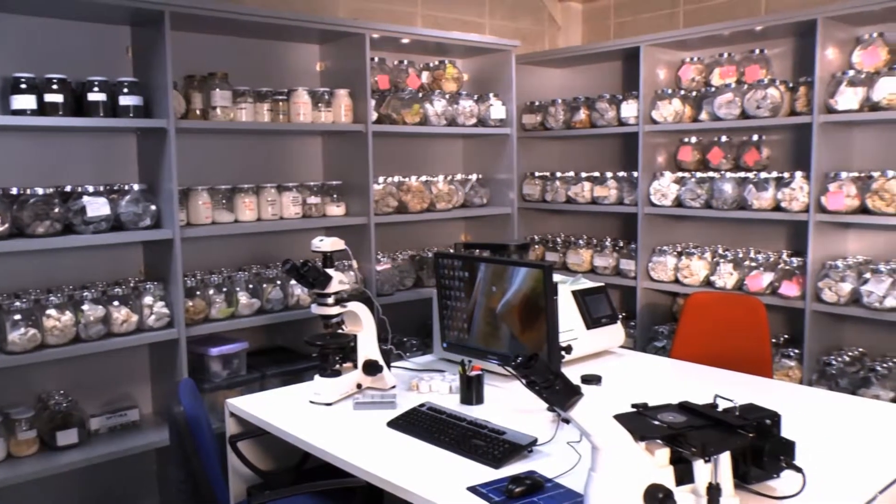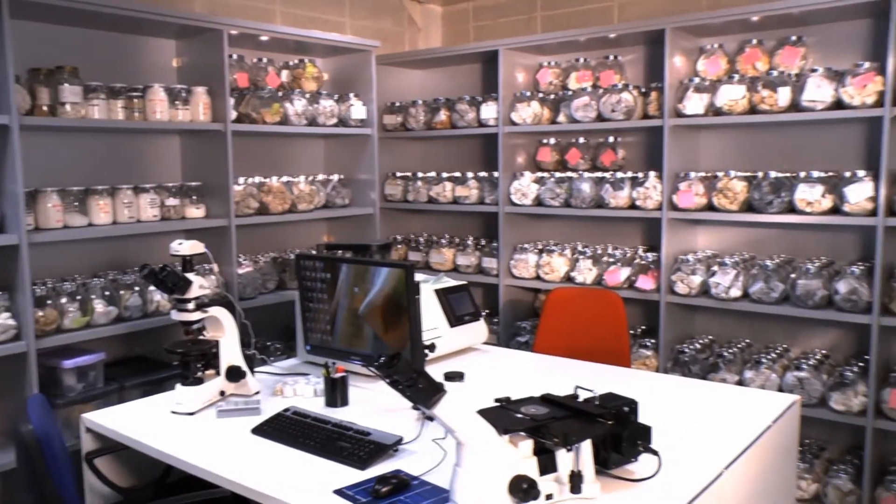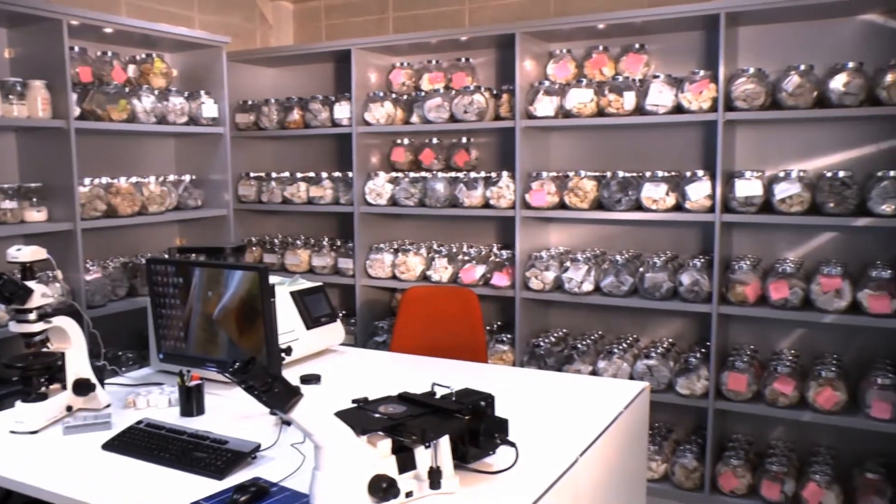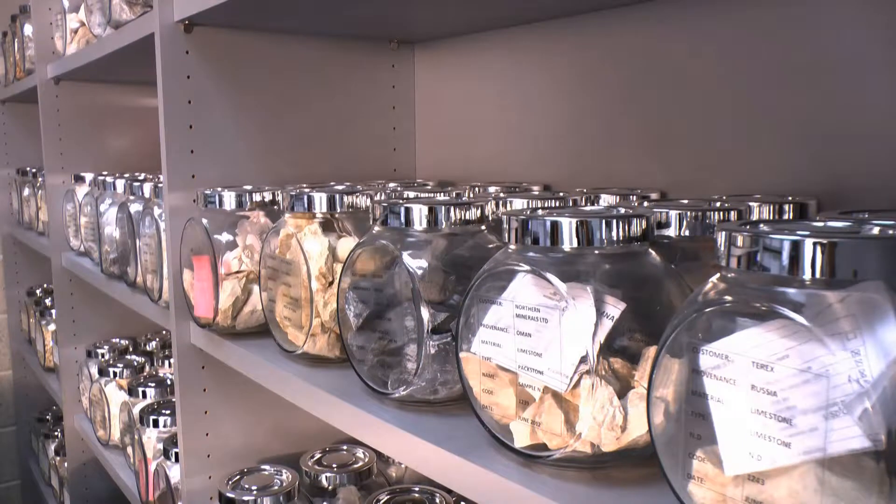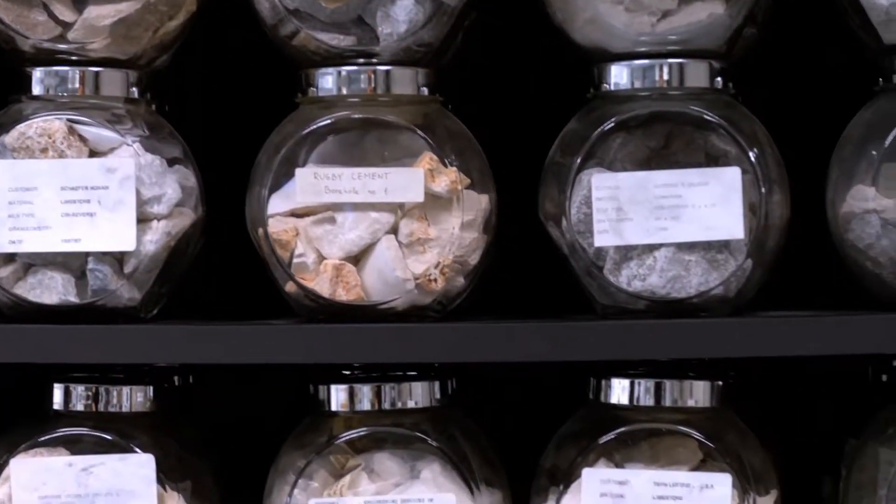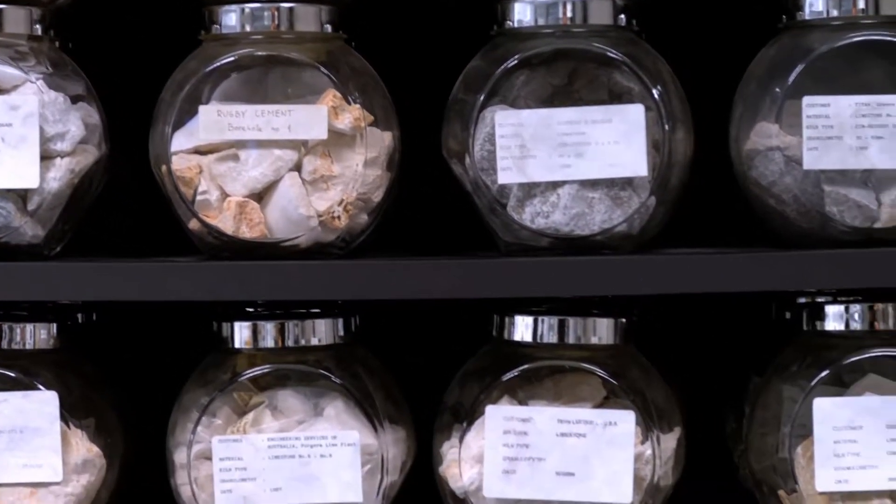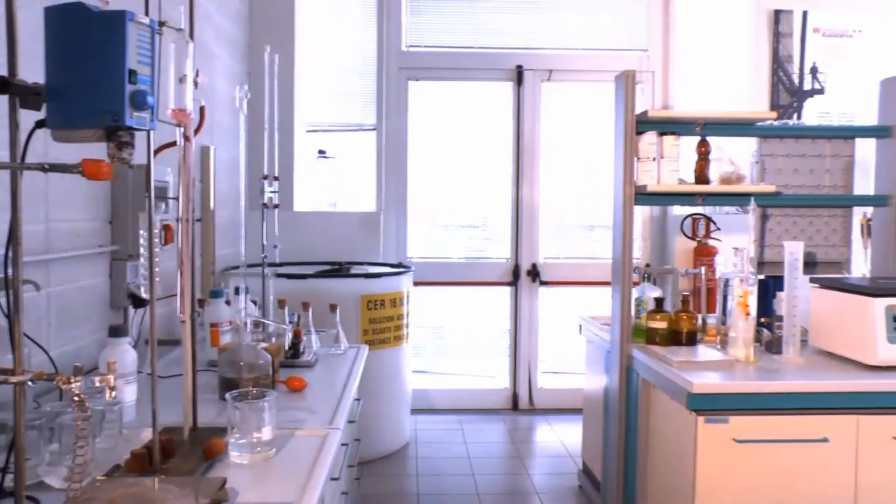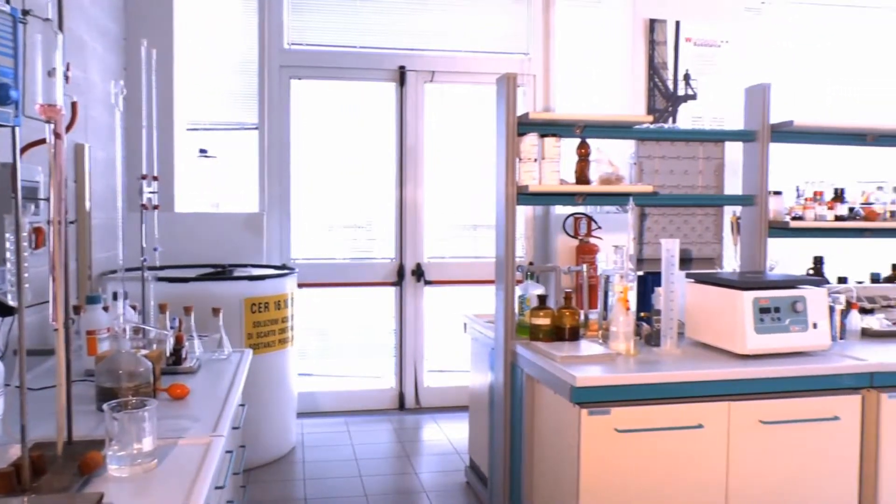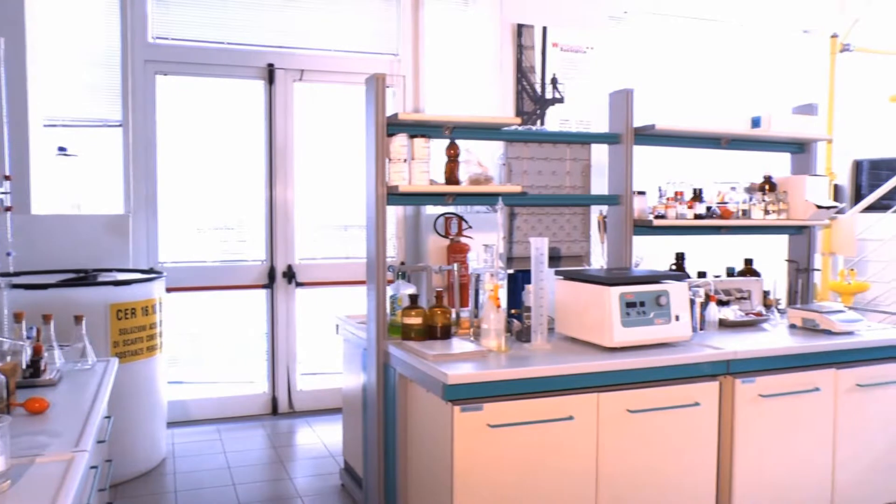Customers from all over the world send carbonate rock samples to evaluate their suitability for the calcination process in our kilns.